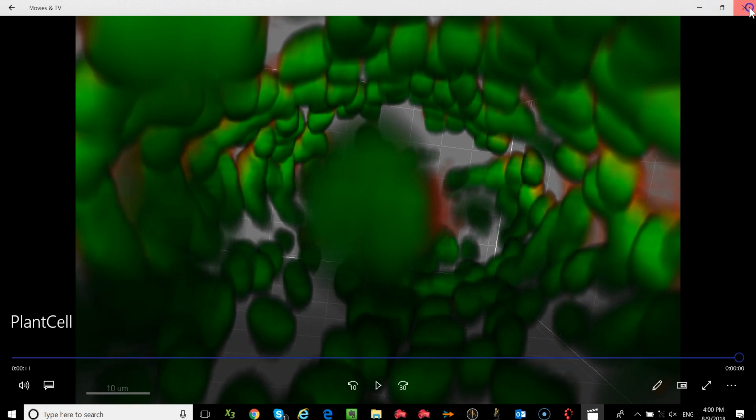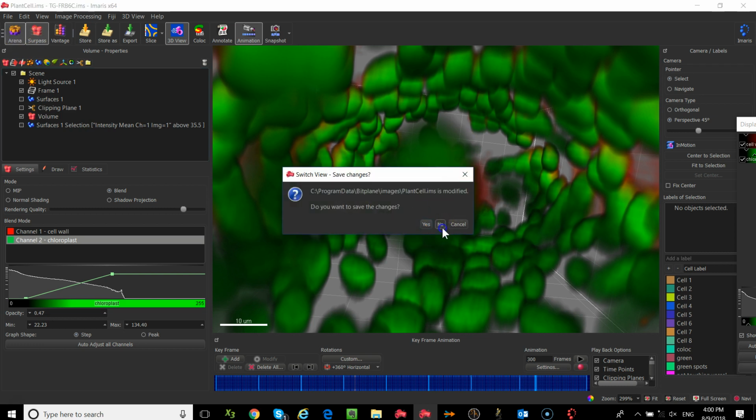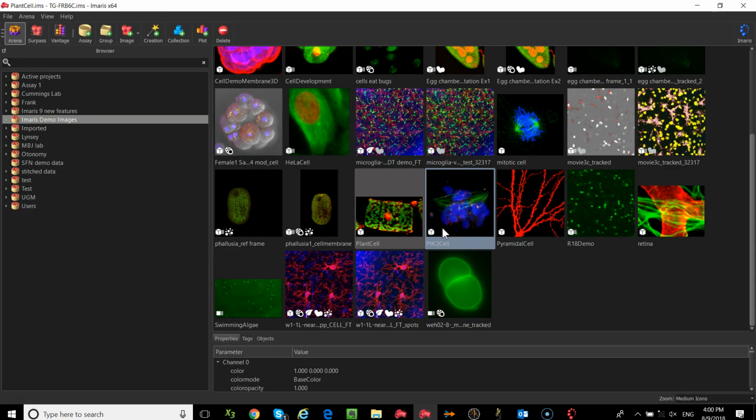Okay. Any questions, or are we good? Good? Okay. So we're going to move on to the next stage, and that is tracking. We didn't do it in the last session, so I promised myself that I would do it for this one. So I think we have about another 15 minutes. Is that right? 15? Yes.